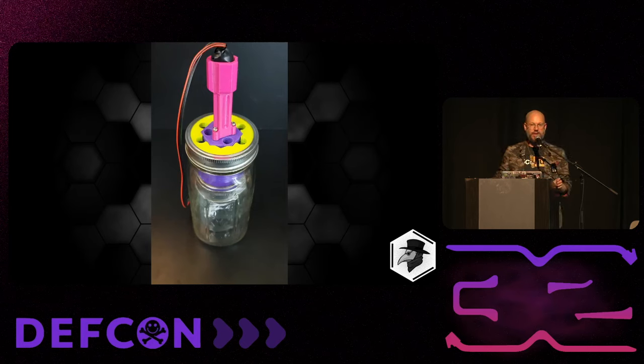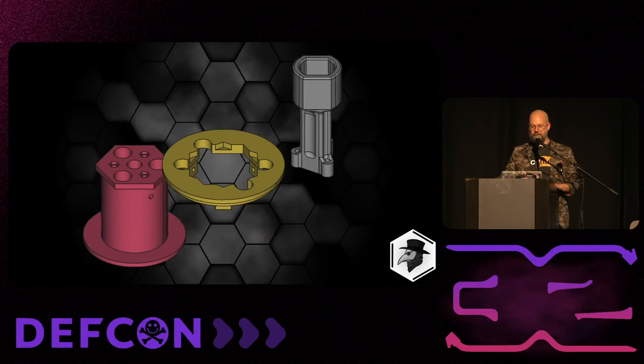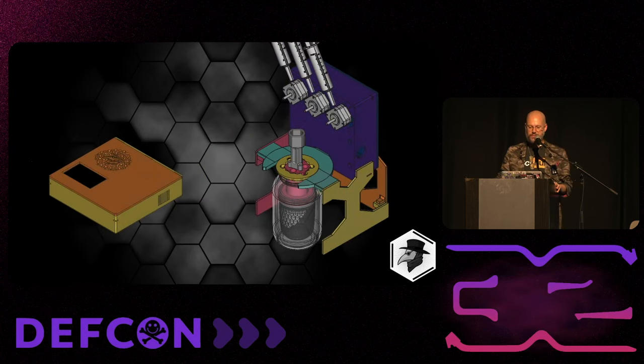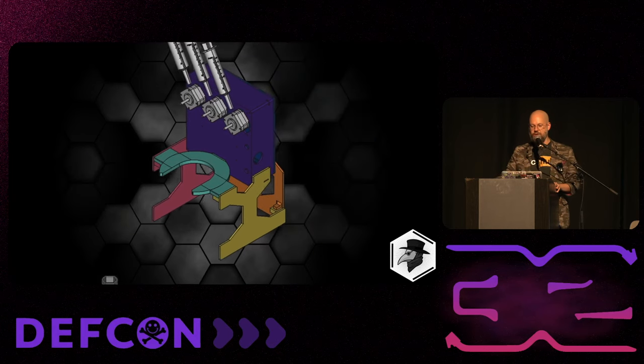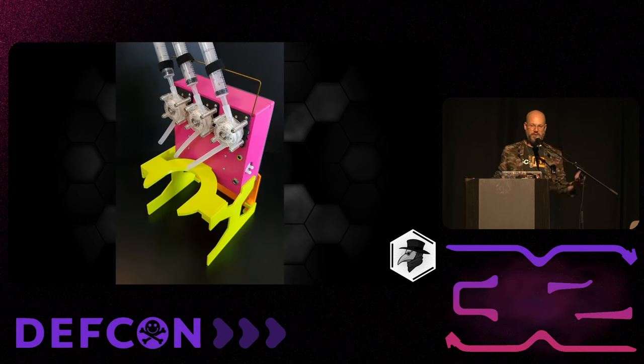This is what it looks like if you can't see super well. That piece that you see in the top, that is the motor that runs the stirring paddle in the bottom. Here's the actual core, and it comes in three pieces and breaks apart like this. Snaps together very nicely, easy to construct. Now, if you look at the rest of the armature here, that purple box houses both the circulation pumps for hot and cold fluid. It also holds the peristaltic pumps, which pull from the syringes. And then there's this armature that holds it all together. Again, this is what it looks like if you can't see super close.